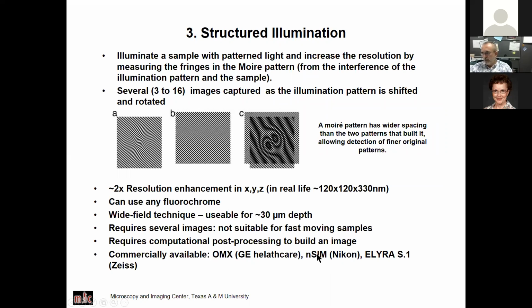OMX, N-SIM from Nikon, Zeiss has one, and this is the system that the image analysis lab in the vet school has. So you can get down to about 120 nanometers in XY, around 300 nanometers in Z. So, about doubling the resolution, which sometimes is quite useful.